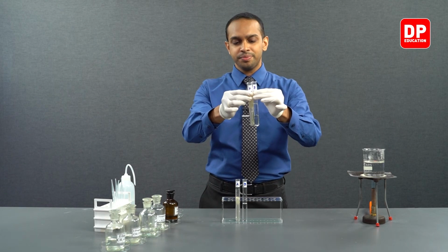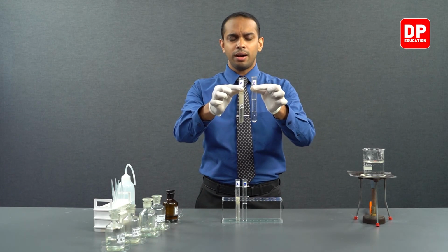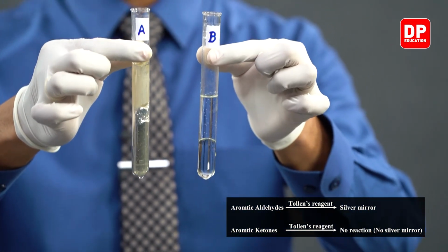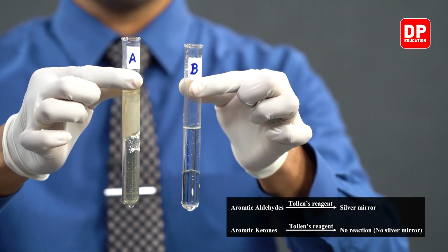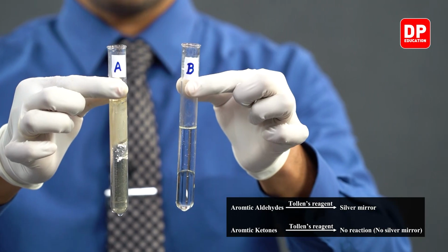You can see here tube A and tube B are different now. As you can see, tube A has formed a silver mirror, but tube B has not formed a silver mirror.